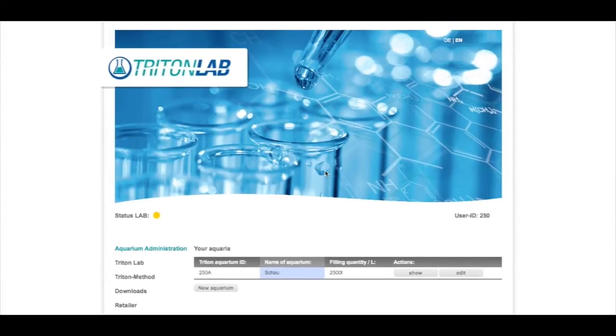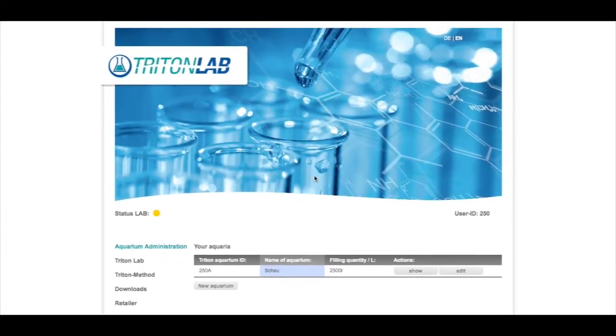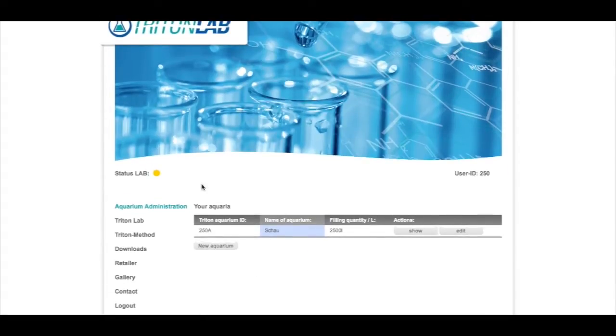I want to show you this time how to work with the ECS, the error correction sheet. This is a follow-up for when you have done a test and need to know what to do next. It's quite easy. I will show it to you because we already uploaded it, so you can download it in the download area now. Let's go on and see how you do it.